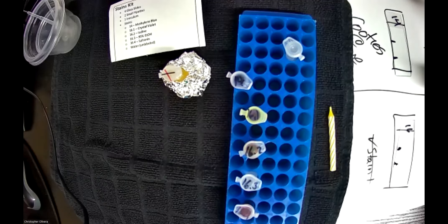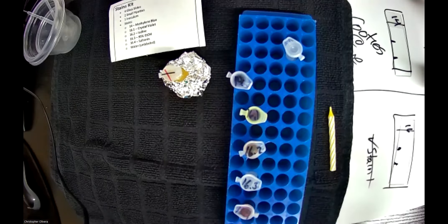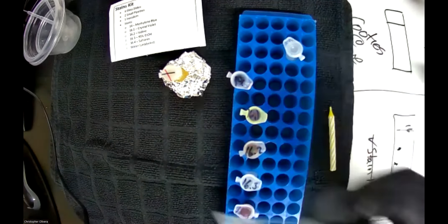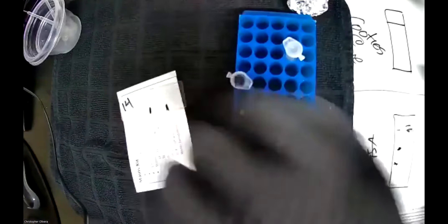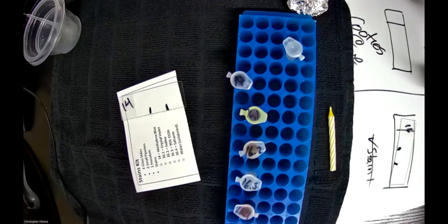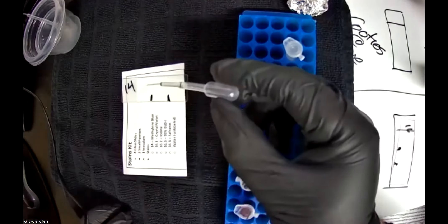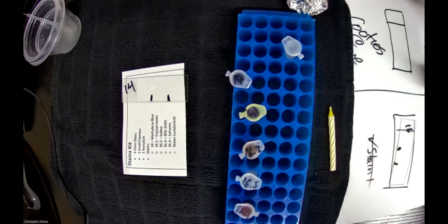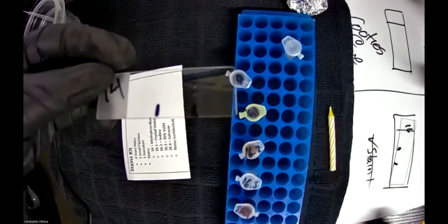Let me put my sharpie away and set them up. You have your inoculum, you have your sample. Normally in the lab we would flame all of these to keep them sterile, but since we're using sterile ones already, we don't have to — they're ready to go. You want to add drops of water onto the slide. Using the technique from the videos, you just want a little bit of water — a small drop so it dries quickly. The bigger the drop of water, the longer you're going to be waiting.